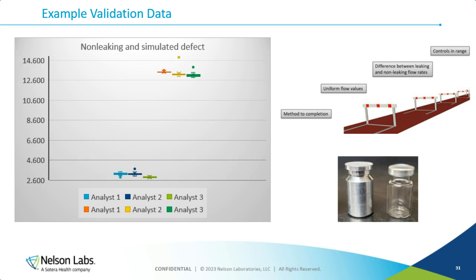uniformity in my numbers from day to day. And these are the same set, because it's a non-destructive test. These are the same set of 30 samples that we used for this particular validation, run over and over. But we will see variance from day to day, and some of that has to do with the ambient humidity that's in the air. So you want to take those types of things into account in your validation. That's why we do it over multiple days.